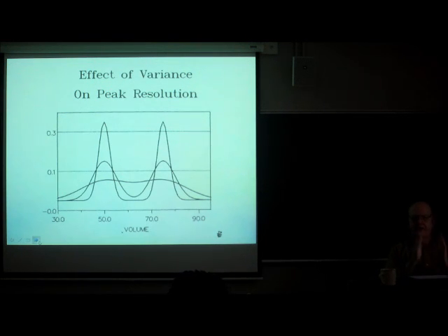So that was the impact of how far apart the peaks are. I didn't change the sigma. In this slide, I'm doing the reverse. I'm going to leave the peaks alone in terms of their position and the amount injected, but I'm going to degrade the resolution by making the peaks wider and wider and wider. So we're going to start in this situation here. We got a really nice peak. The peaks are far enough apart, and each is narrow enough so that I get a nice little stretch of baseline between them.